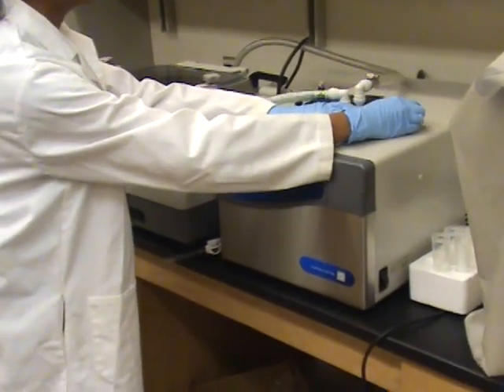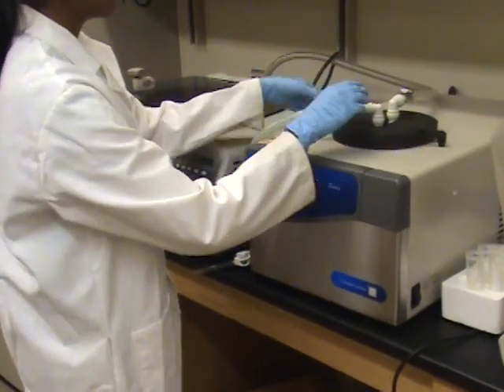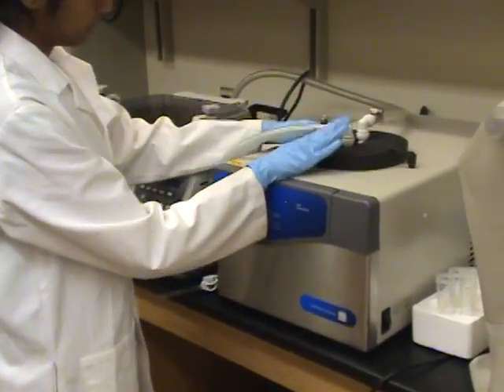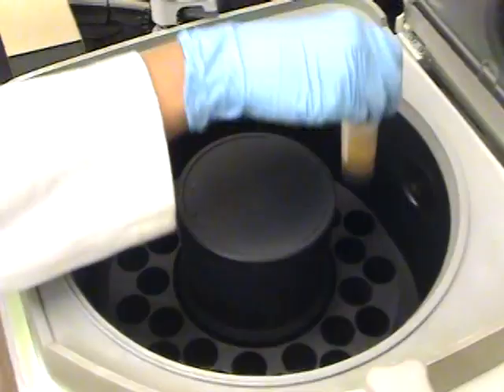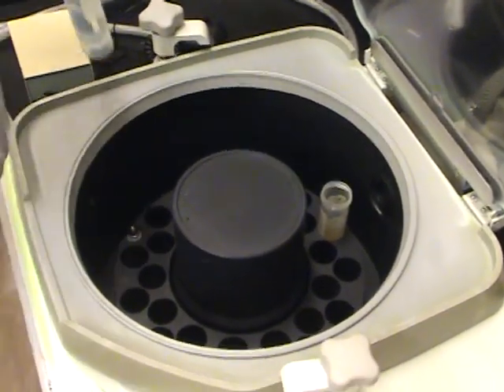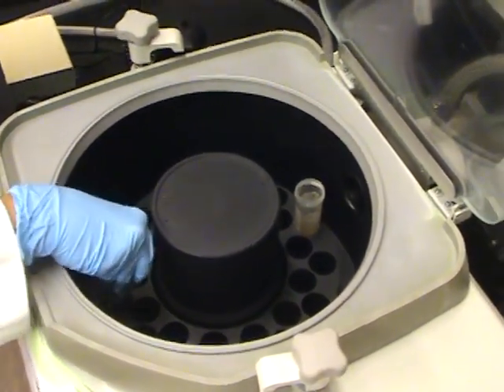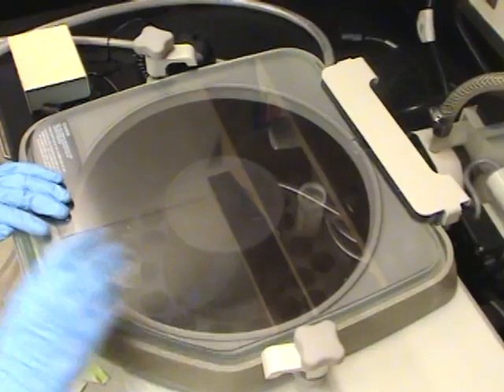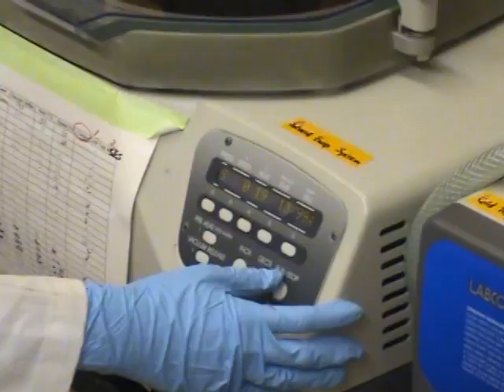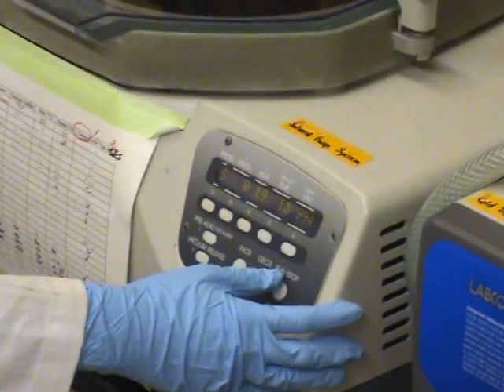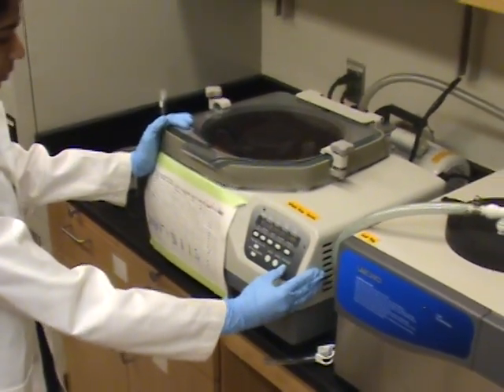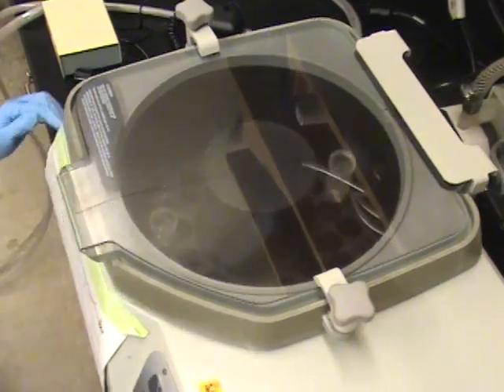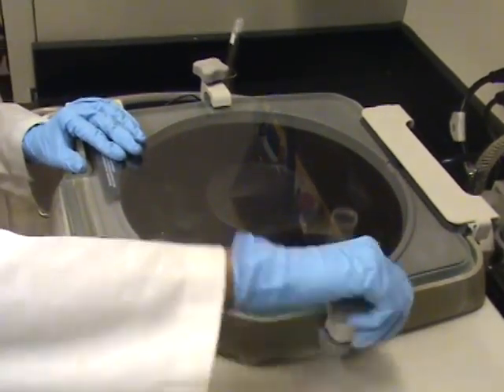Next, turn on the cold trap and build up a vacuum. Load the solvent evaporation system with the tubes, making sure the caps are removed. Close and tighten the lid. Set the appropriate speed, temperature, time, and vacuum pressure. Then, turn the machine on. This machine allows the vacuum to suck out all of the hexane and leave just the lipids.